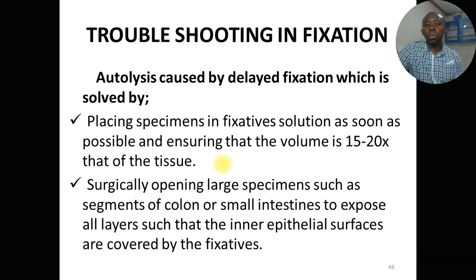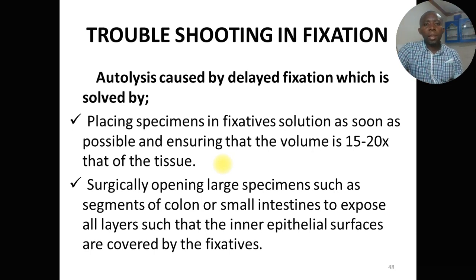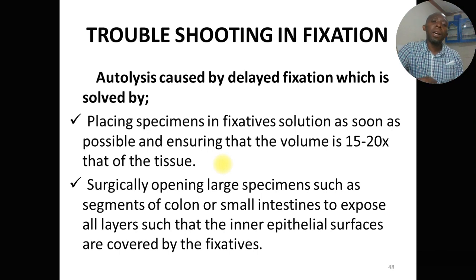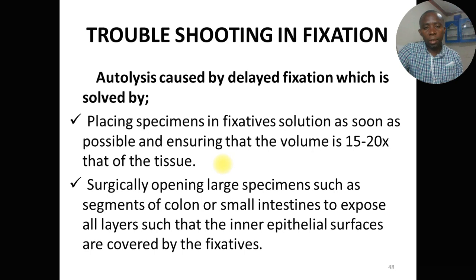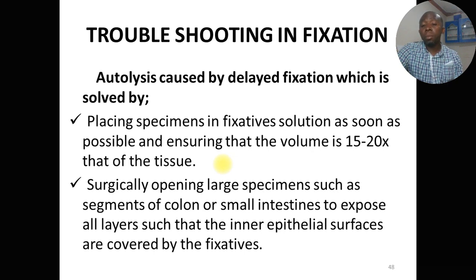For troubleshooting fixation problems: autolysis caused by delaying fixation can be addressed by placing the specimen in fixative solution as soon as possible and ensuring the volume of fixative is at least 15 to 20 times that of the tissue. If tissue is not fixed well, consider surgically opening large specimens or performing bread-loafing to ensure the fixative reaches all parts.